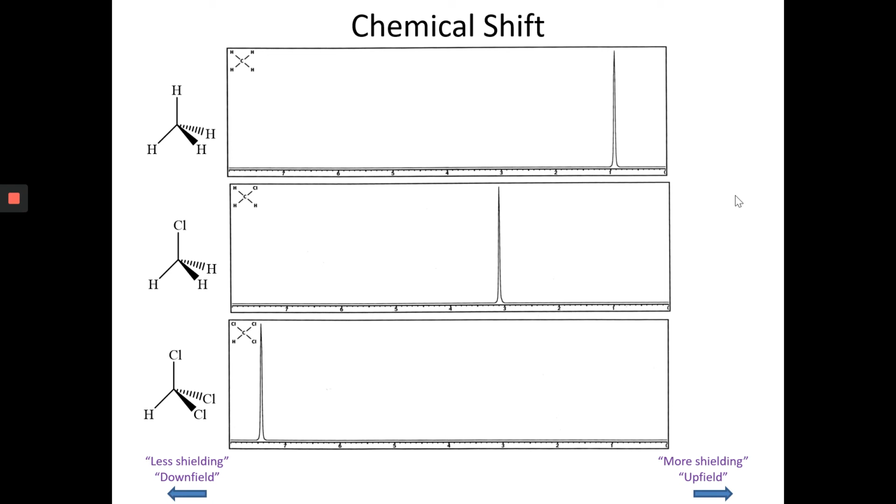It's about halfway down, not quite halfway down. You can see it's a hydrogen bonded to a carbon, and that carbon has on it a chlorine. And if you look to the right and see what the chemical shift is on your sheet, it says between 3 and 4. And sure enough, when we look at chloromethane, our chemical shift is between 3 and 4 for this signal. That's for 1 chlorine that's attached.